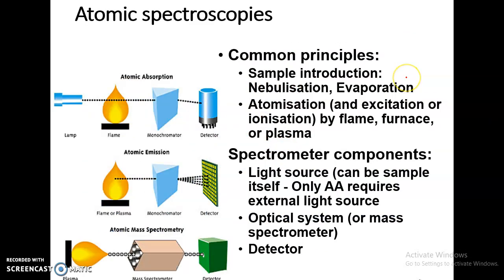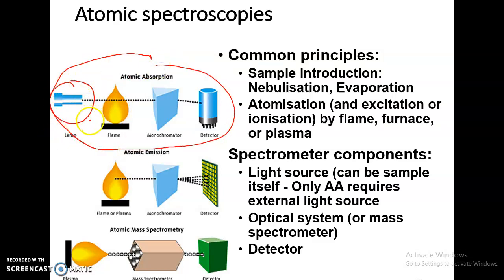So this is the schematic diagram of the AAS only. You have a lamp to bombard radiation towards the sample.